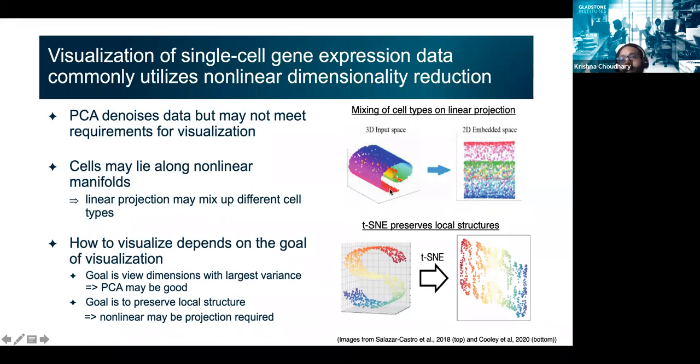So let's say we start with a population of cells which are lying at this kind of position, where here I have in this figure a rolled paper kind of a thing. So let's say our starting population of cells were located in the gene expression space, or in our PC space, in this red region of the paper.